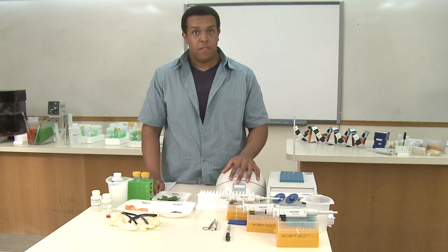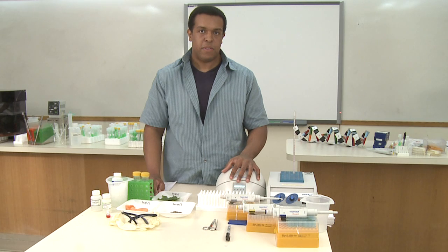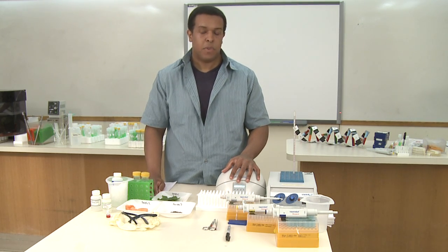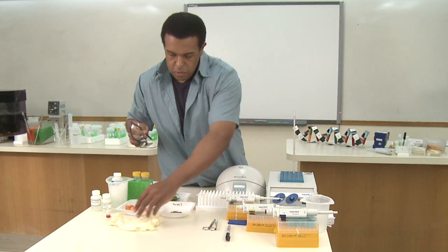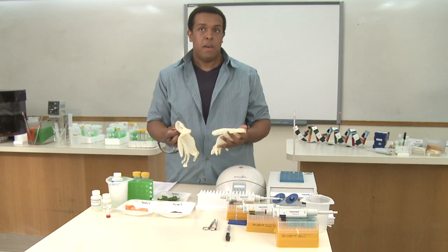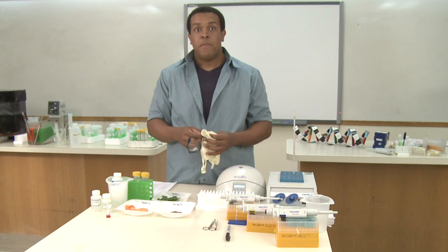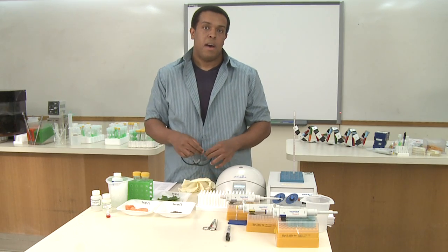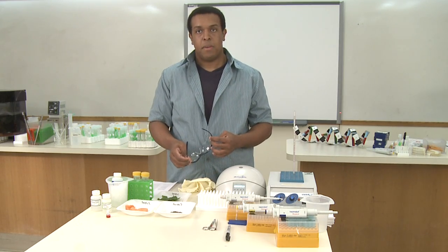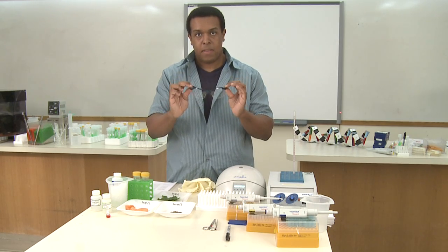All of the chemical reagents we'll be using in this protocol are extremely safe, non-toxic, non-hazardous. However, it's always good scientific practice to use personal protective equipment. So if you choose to, you can wear a pair of latex gloves. Just be sure to change them frequently in order to avoid cross-contamination of samples. For the protein precipitation step, since the chemical can be a little bit of an irritant, you may choose to wear goggles, and that's what's recommended, so I'll be wearing that during that step.